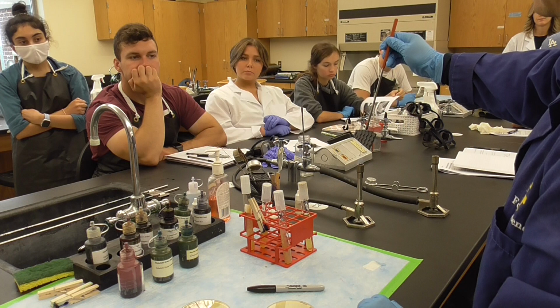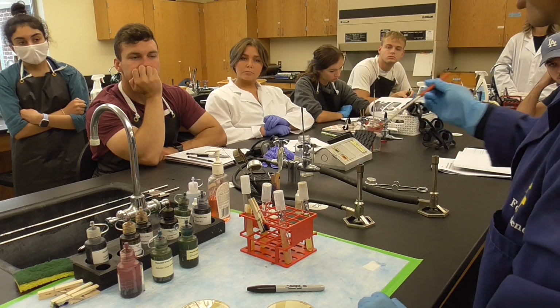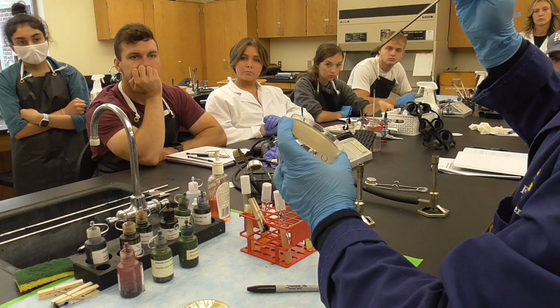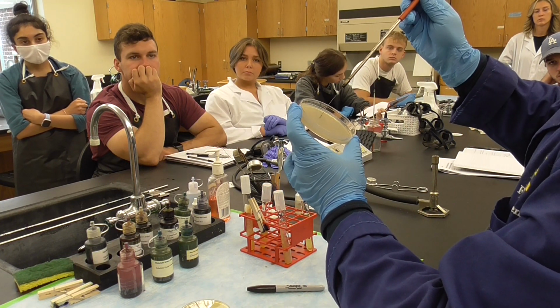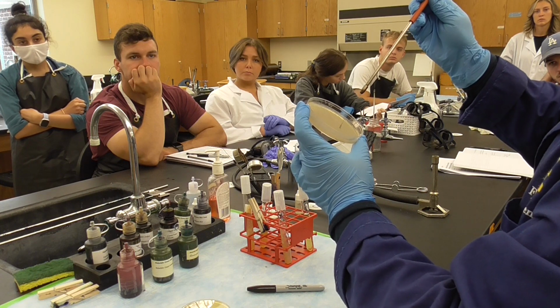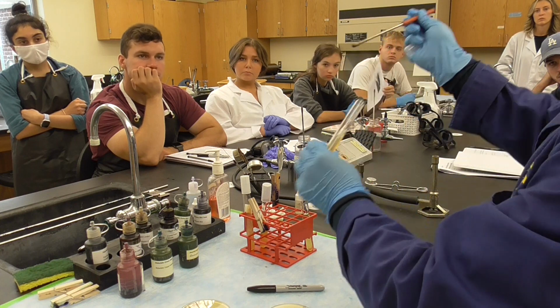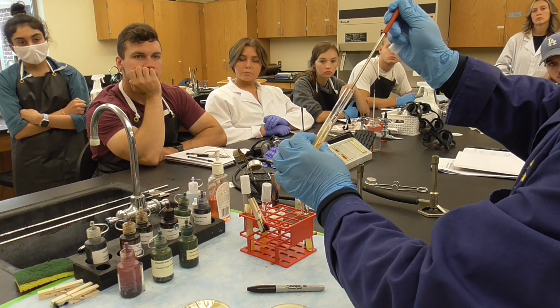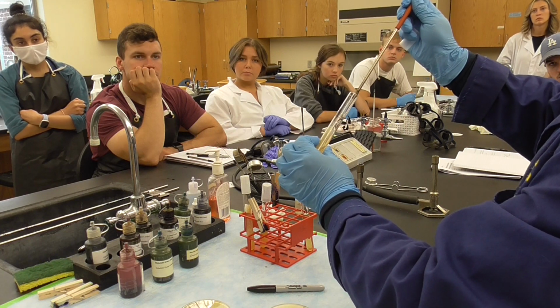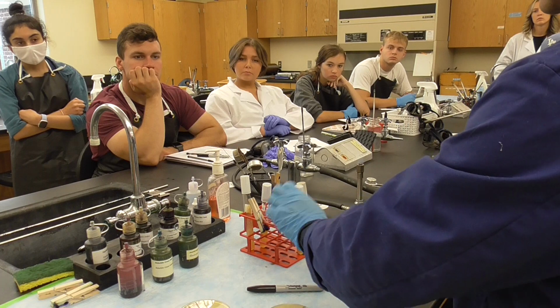How about slant? Slant is simple. Flame it. Kill the bacteria first. A little bit at the top. Then cool this down on the side. Okay? Then pick some bacteria right here. Then the slant will be a zigzag from the bottom to the top. Zigzag. You don't have to break it. And then flame it. Okay.